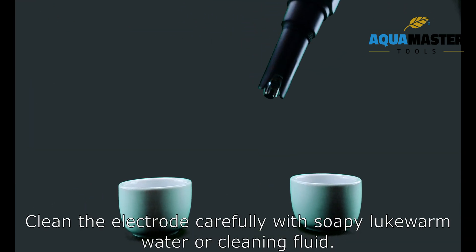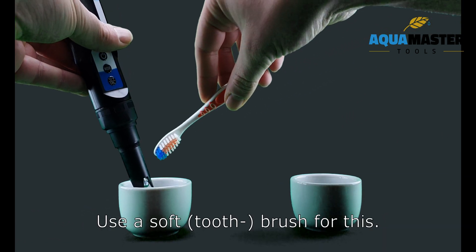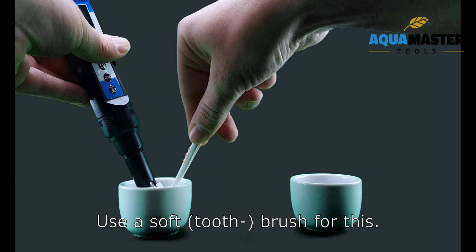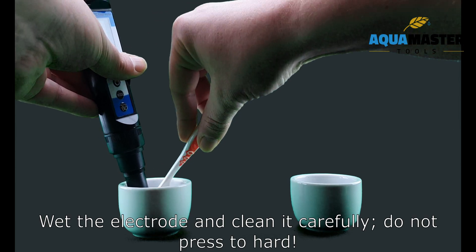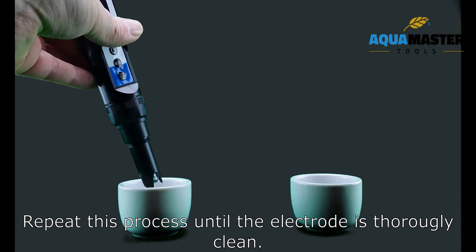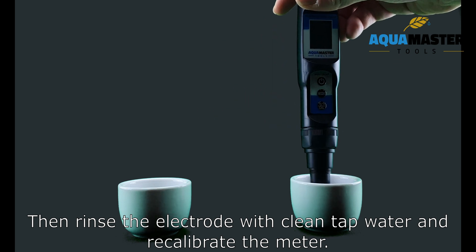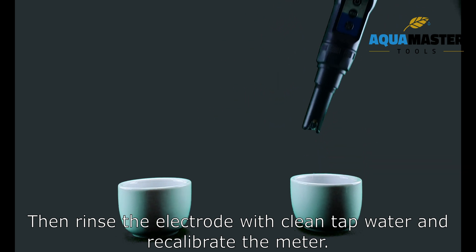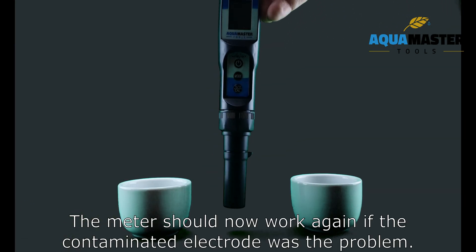Clean the electrode carefully with soapy water or cleaning fluid. Use a soft brush, wet the electrode, and clean it carefully — do not press too hard. Repeat this process until the electrode is thoroughly clean. Then rinse the electrode with clean tap water and recalibrate the meter. The meter should now work again if the contaminated electrode was the problem.